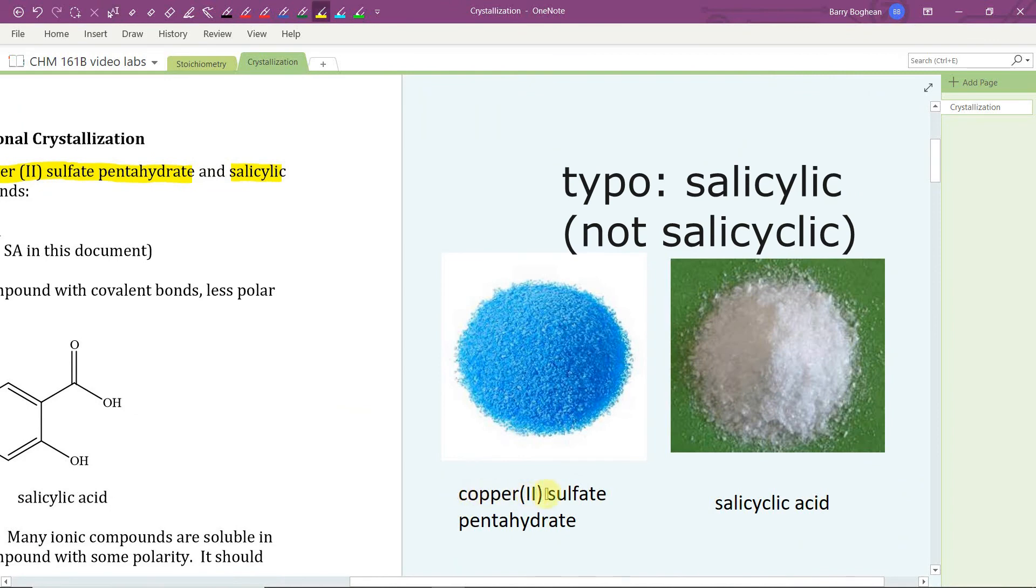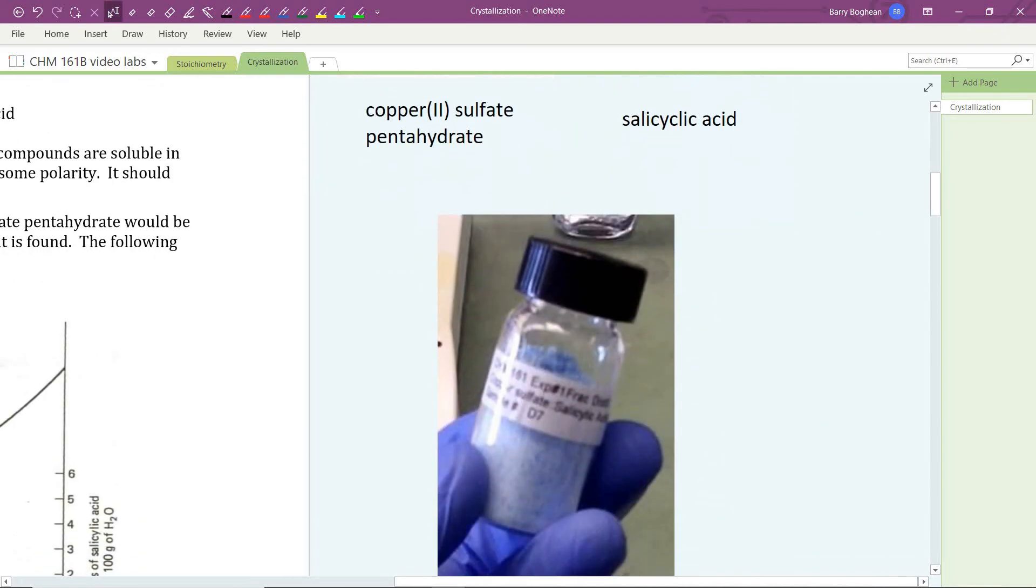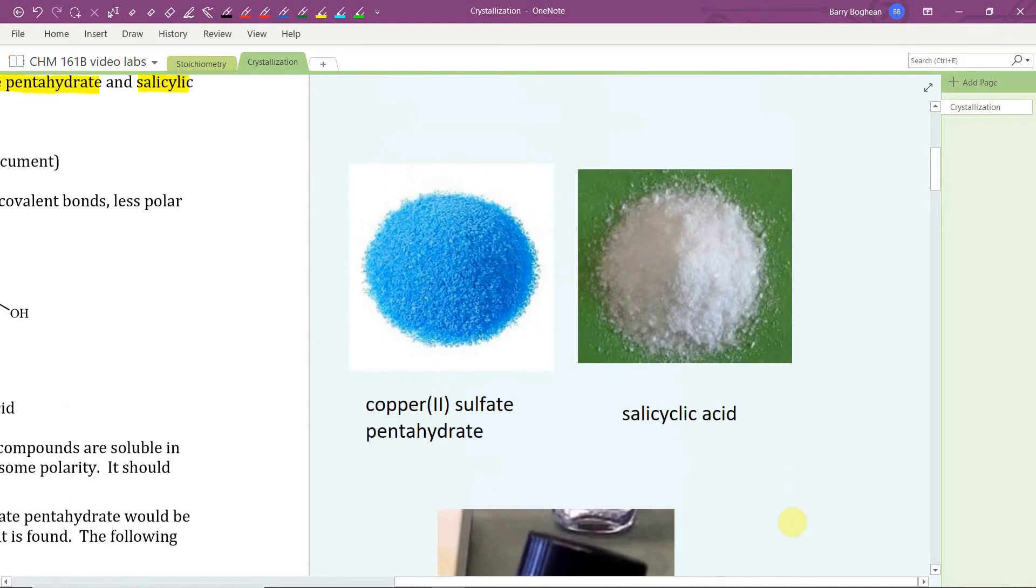Let's take a look at those two compounds to start with. Copper(II) sulfate pentahydrate is a blue crystalline salt and salicylic acid is a white solid organic compound. We will start with a mixture of the two, separate this mixture, and determine the percent composition of it.